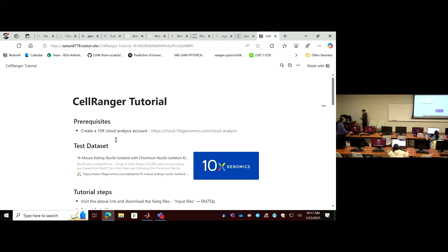Okay. Hi everyone. I am TAing this semester for Dr. Kai. I'm also a third-year PhD student in his lab. I'll be running through this tutorial and getting you all familiar with what the Cell Ranger pipeline is and how you deal with the FASTQ files that the TIGS or the genomics core at A&M sends you.